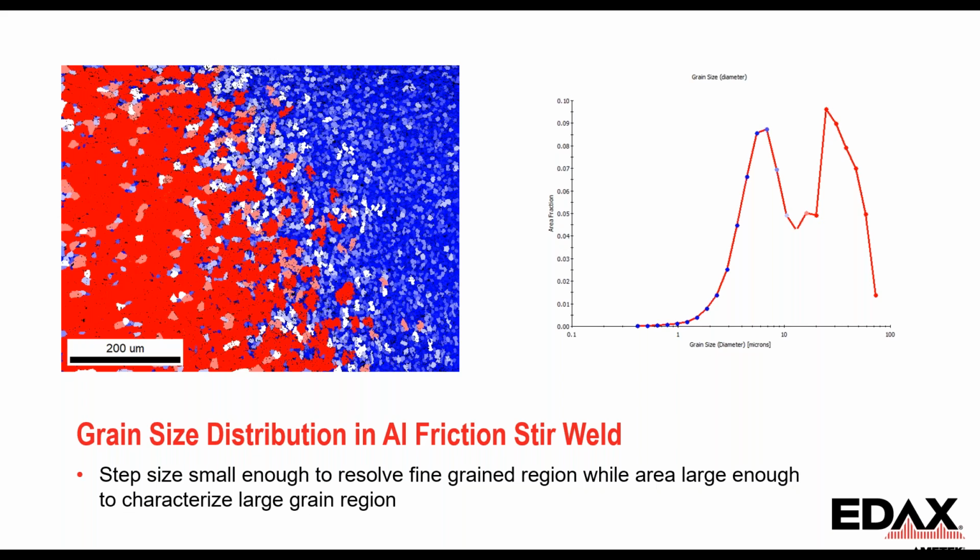And we can assign a color to it, let's just do a continuous color from blue to red across that distribution. And we can see that, sure enough, the small grains and the large grains are where we think they are, but we have enough data points to be able to resolve the smallest grains statistically and then able to take this data and break it down into small and large grained regions from this sort of bimodal distribution. So again, with this, we can analyze this full field of view in one pass.